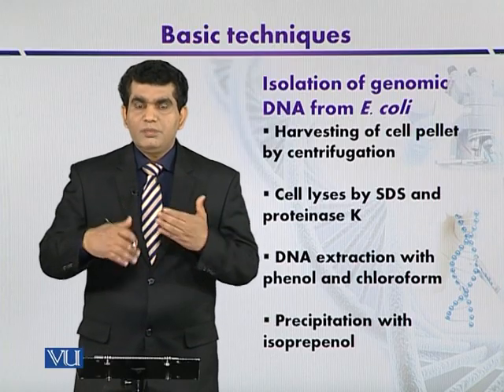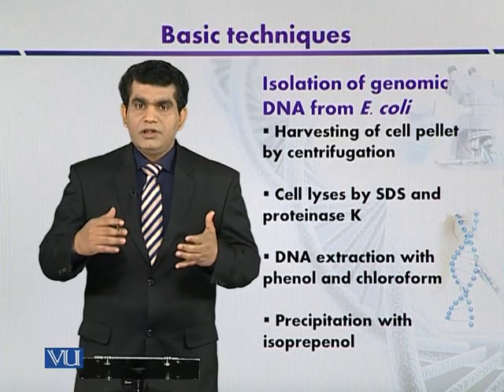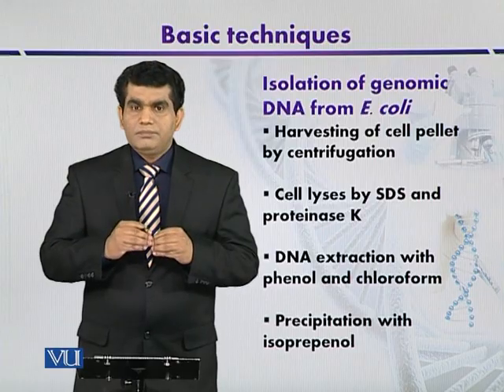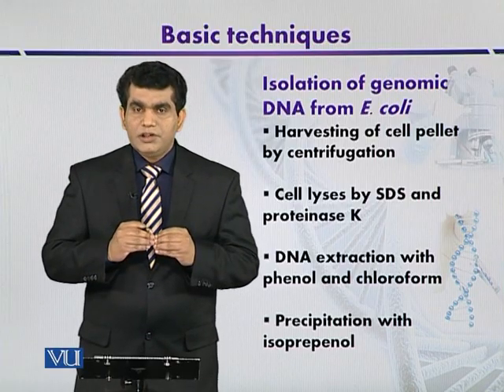Now, once genomic DNA is isolated, then how can it be analyzed? कि DNA isolate हो गया है, हमें कैसे पता चलेगा कि हमारे एक्सट्रैक्ट के अंदर DNA जो है वो isolate हो चुका है?